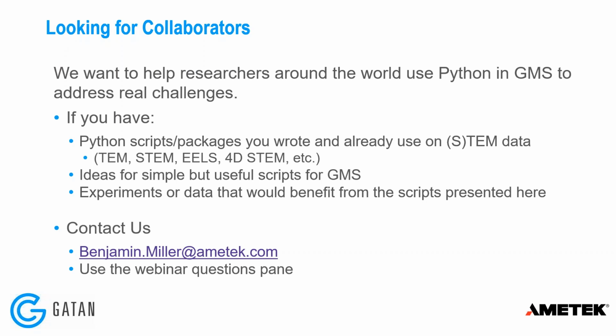And so if you have Python scripts or packages that you wrote and already use on TEM or STEM data, or you have ideas for simple and useful scripts for GMS that you wish existed, or you have experiments or data that you think would benefit from the scripts that I've presented here today, please feel free to contact us, contact me via email, or you can use the webinar questions pane today and let us know what your interest is and how you can help us to help you.